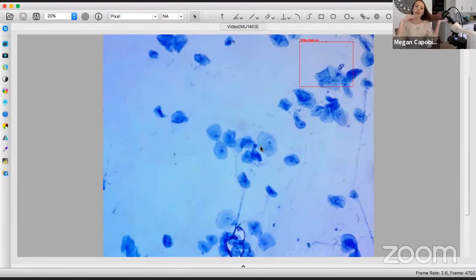Now, what are some things that you're noticing are different about these compared to the plant cells? Well, we're probably noticing that they're not stacked together like the onion bulb epidermis was, and they don't have the same shape either. Remember, those plant cells are going to be more structured because they have a cell wall. Animal cells do not have a cell wall.